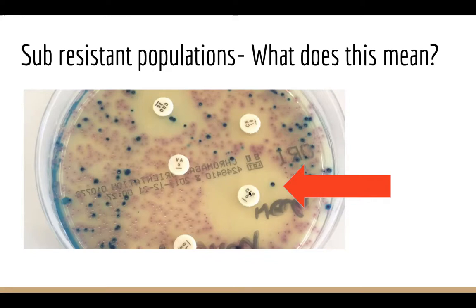And so in fact, it's better to test against further antibiotics before going on to these, because you might end up with a latent infection, which increases the resistance of this subpopulation. And so this would be what takes off the entire plate. And also this isn't a very good inoculation because you can see the individual colonies.